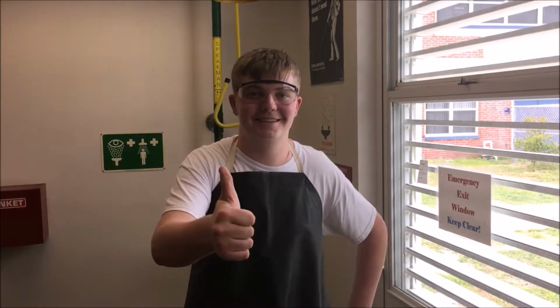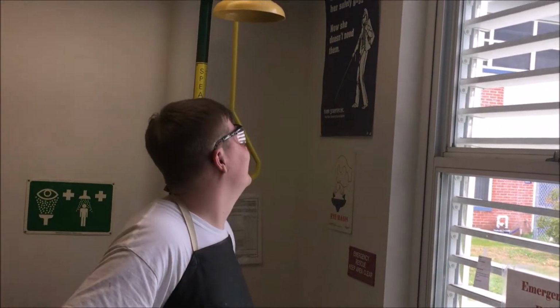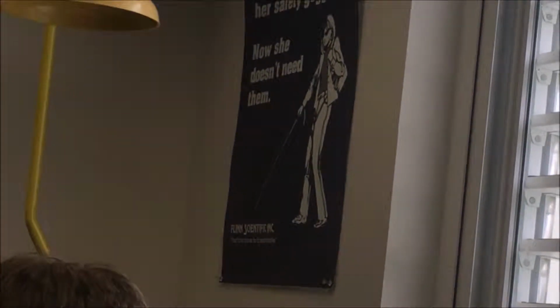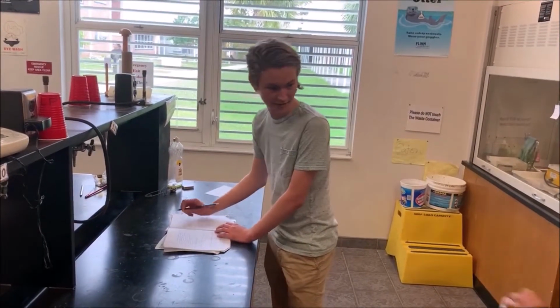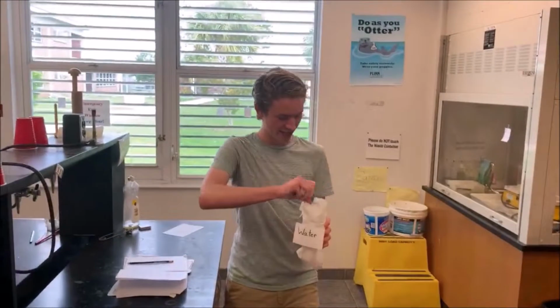Gallant always wears his safety gear in the lab. After all, he remembers what happened to Carol. Goofus, on the other hand, wears no safety gear in the lab, and what's this? He's eating and drinking too. Tisk tisk.